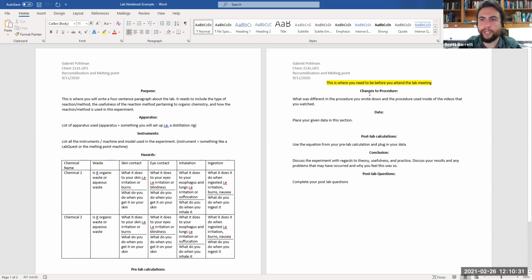So you really want to make sure to never place something that's scalding hot into some ice cold freezing situation. And that's a safety feature that everyone needs to know, not only for lab, but also for real life examples, that you should never put a hot piece of glassware into ice cold water. And I believe that's about it for the lab notebook that I wanted to review today.